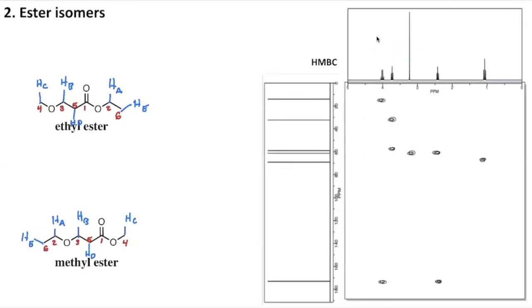Okay, same thing goes here. First and foremost, letter all of your peaks. We'll draw in our cross peaks, and then we'll get started analyzing what's actually happening with all of these correlations. So starting with our letters for hydrogens and numbers for carbons, we are all set there. And then let's start drawing in some correlations.